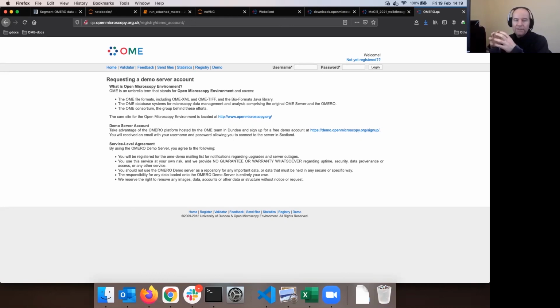Okay, and this service is being kept up by the Ome team, with the caveat, of course, that the Ome team does not have endless resources for a service like that.